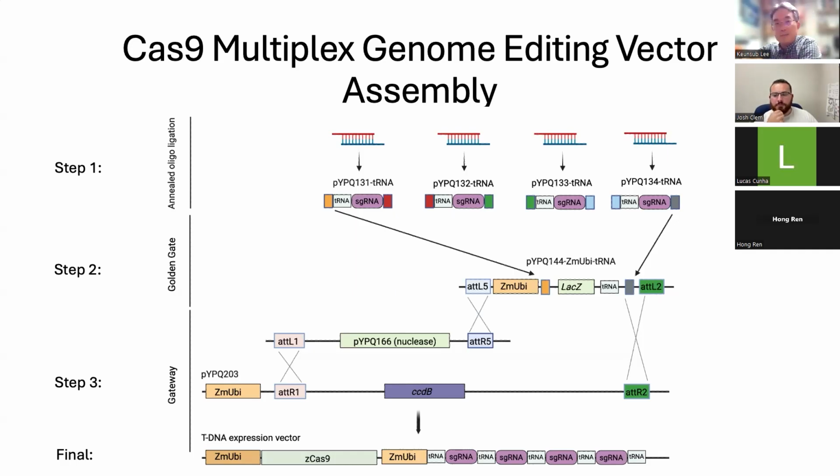Yeah, actually, if you want to optimize it, you want to test different combinations of promoter and terminator interactions. If you're looking for stronger expression, the extensin gene promoter and terminator from tobacco gives very, very strong expression in both monocot and dicot. And you can also consider a chimeric terminator or 3' UTR. This one was already published several years ago. You can look for the chimeric 3' UTR for gene expression. It was a 2018 Plant Biotechnology Journal paper.